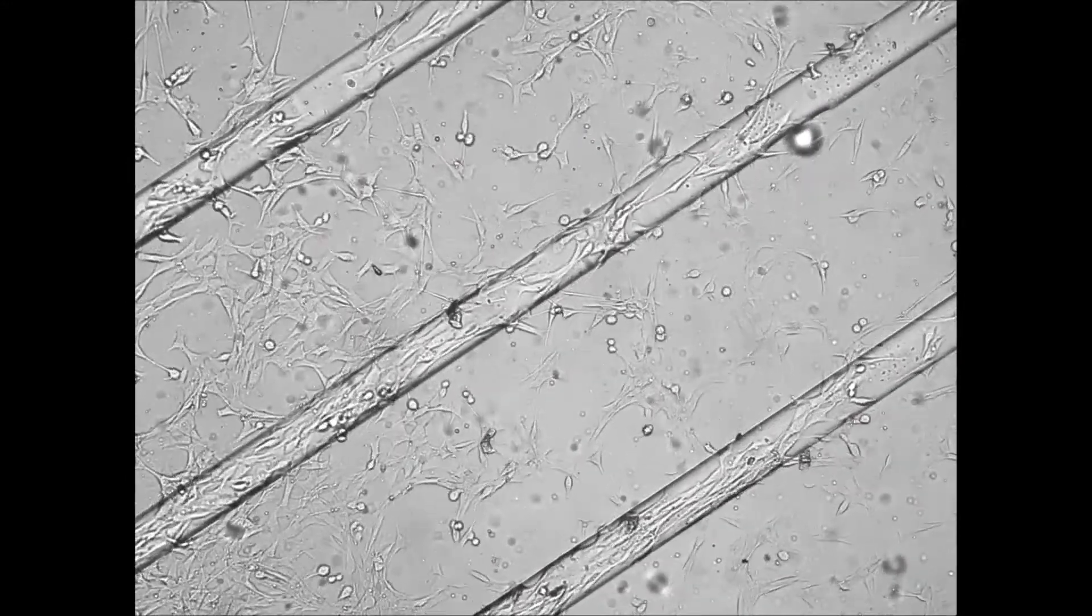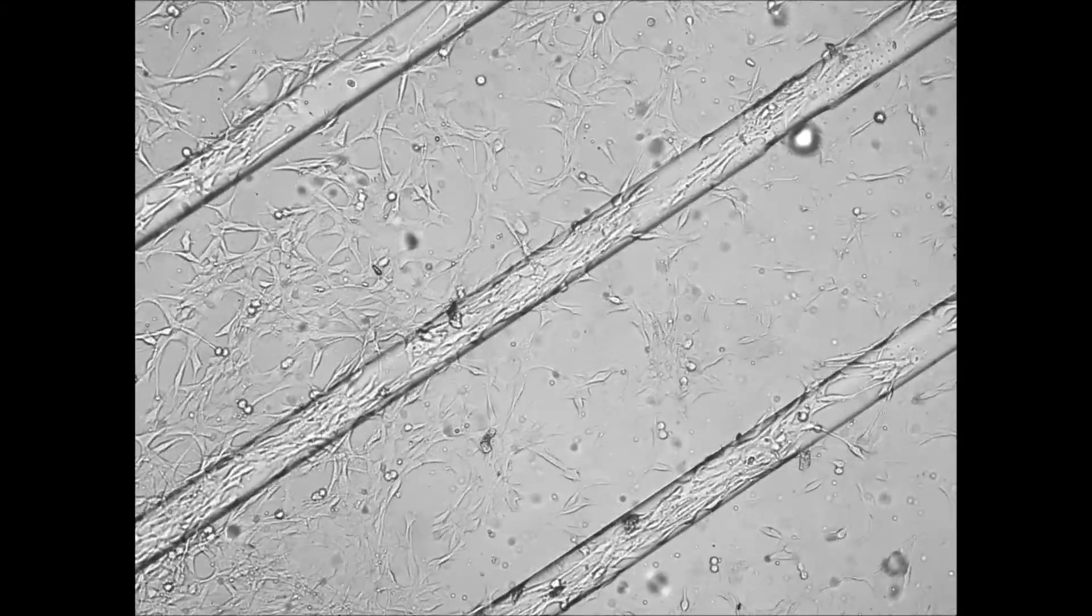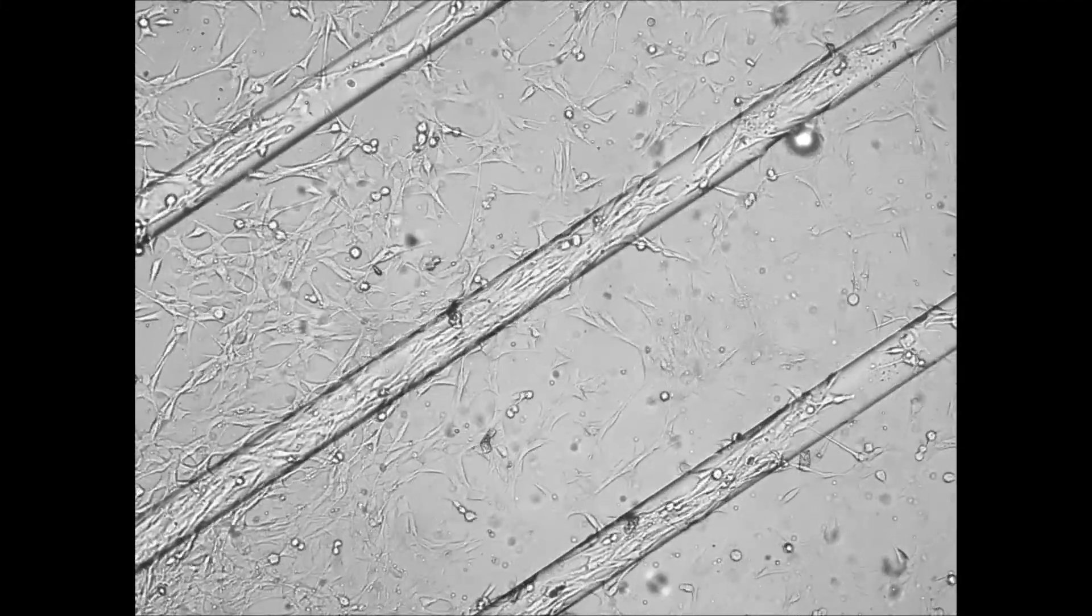Here you can see a video of our cells live imaged for one and a half days. It seems like the cells align along the curvature.